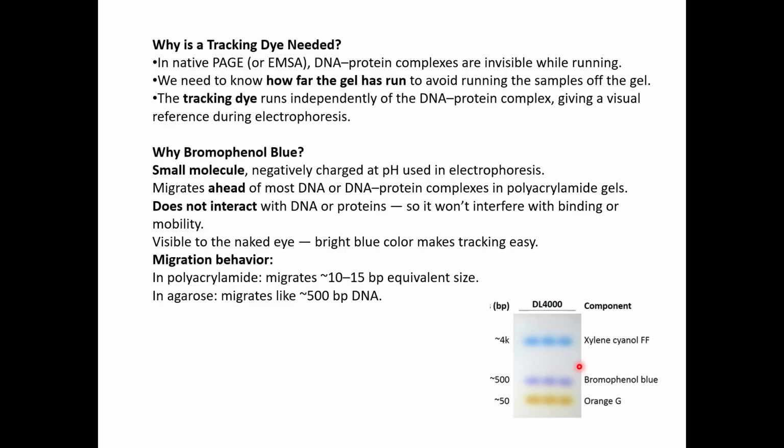It will also run at the same rate along with the sample. So it is just to give you a line of visualization. Other than that, it does not react or interfere with your protein or DNA, especially in case of EMSA or anything. It does not interact with your protein DNA complex.